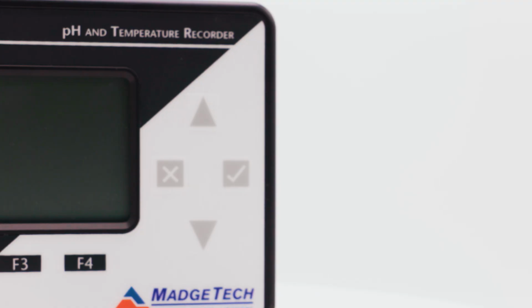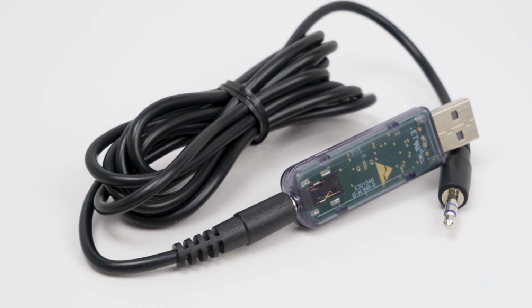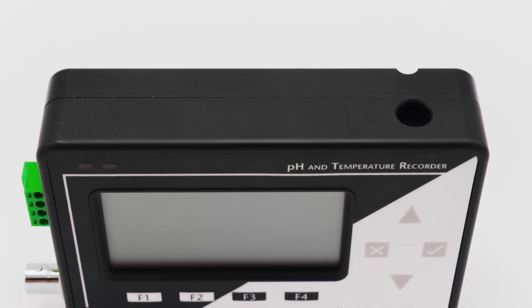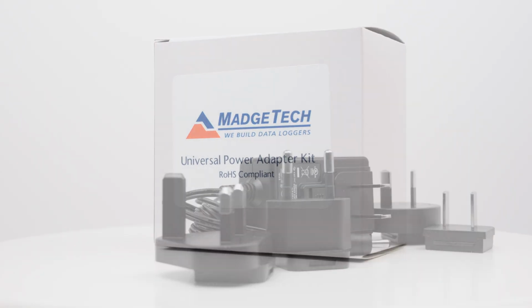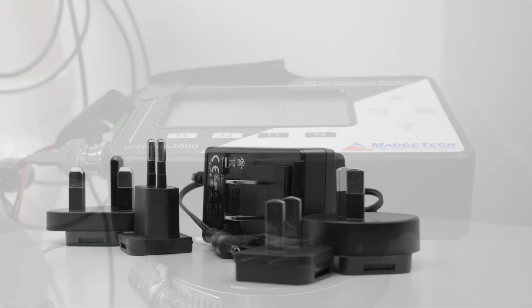On the right side of the data logger is a 3.5mm communication jack that can be used to connect the pHTemp2000 to a PC using the MadgeTech IFC200. The top of the pHTemp2000 is where you'll find the power jack and where the MadgeTech universal power adapter can be plugged in, giving the data logger continuous power instead of drawing power from the internal battery.